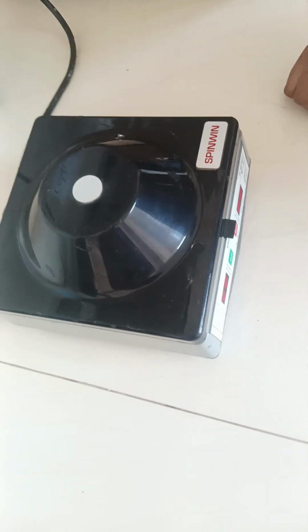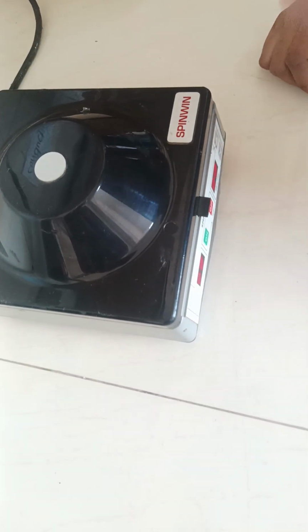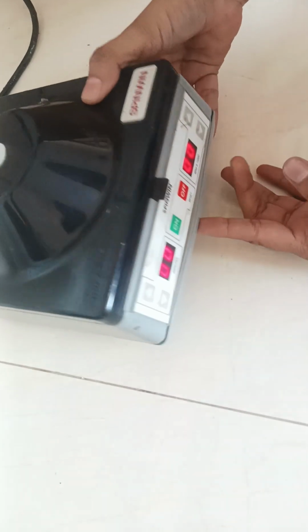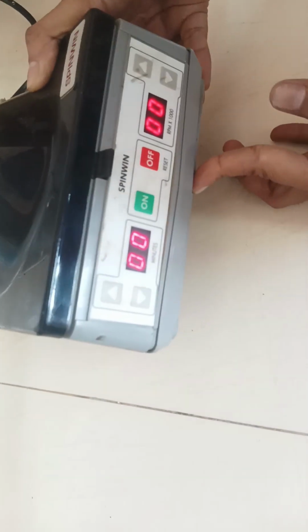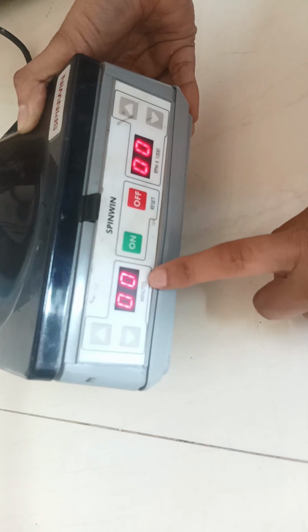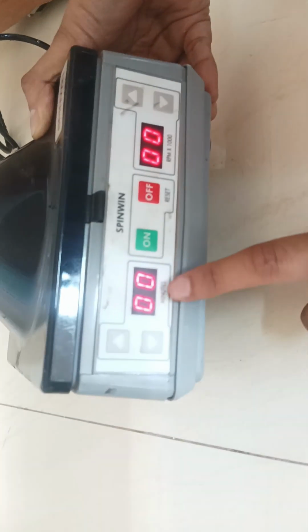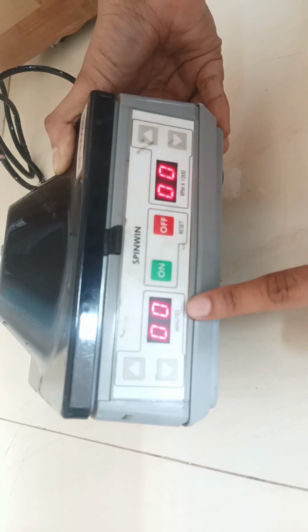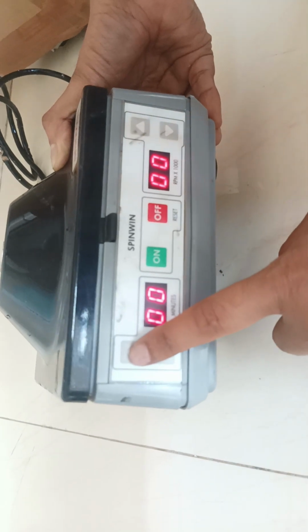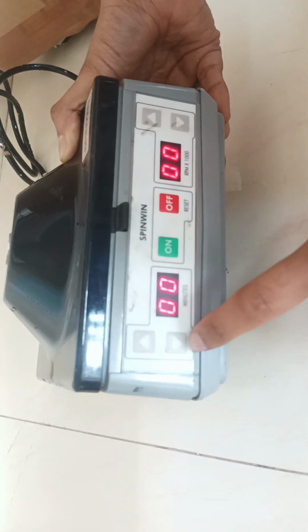But many a time our sample quantity is small. In that case, we should go for the use of a mini centrifuge. Here you can see this is a mini centrifuge which we have. You can see the display on which the timer is shown, in minutes. You have to set the timer with the help of this. These are the arrows to set the time, up arrow and down arrow, so you can increase or decrease the duration with the help of these arrows.